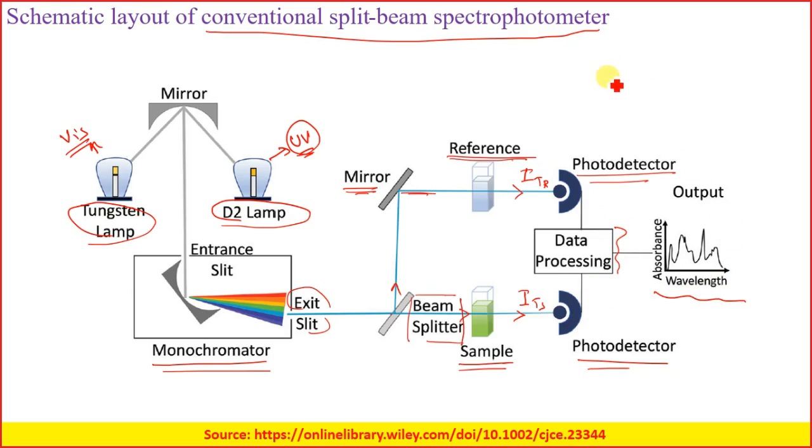Many of you must have heard of a differential amplifier. What it does is, you have a reference and a test amplitude that come in, and at the output you get the test minus the reference, the difference between these two. Similarly, for these photodetectors in the data processing, we go for these differential calculations. The inputs are the outputs of these photodetectors, and then you get the wavelength spectrum.